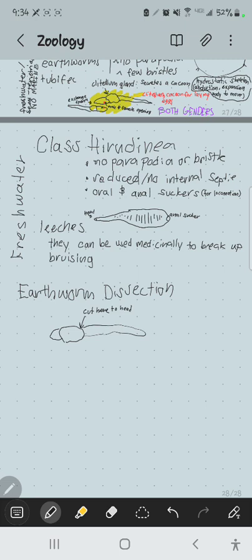But with the earthworm dissection, there's more going on there. And so let's go ahead and draw that. So what you're going to end up with basically is the worm's head here, and you will then butterfly the body like this. Here's a worm like this. So you basically made a cut that ended at the head and started about halfway down like this. So you've snipped here, cut all the way to the head, and then you've teased the body out like this.